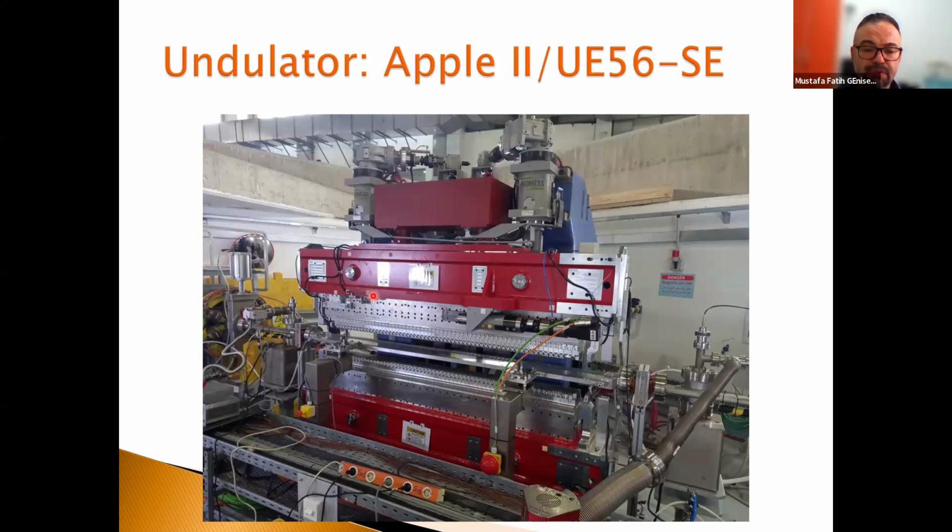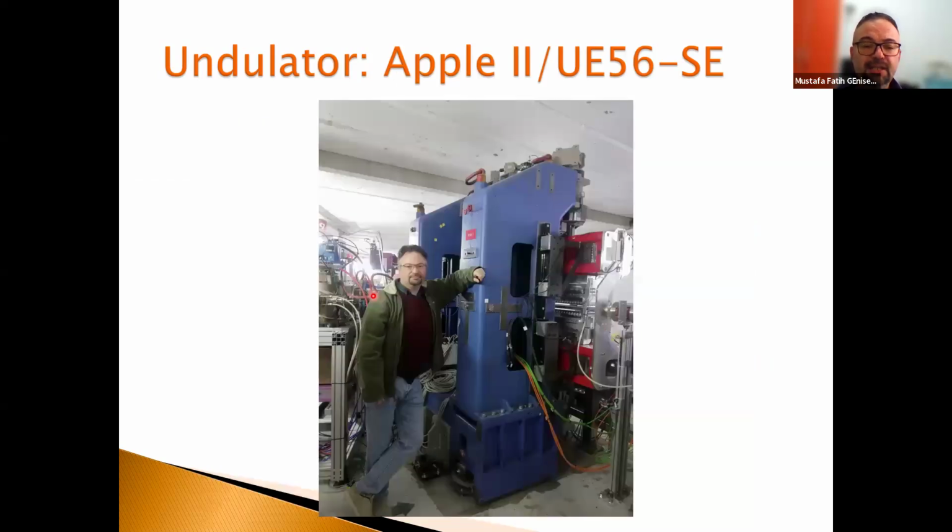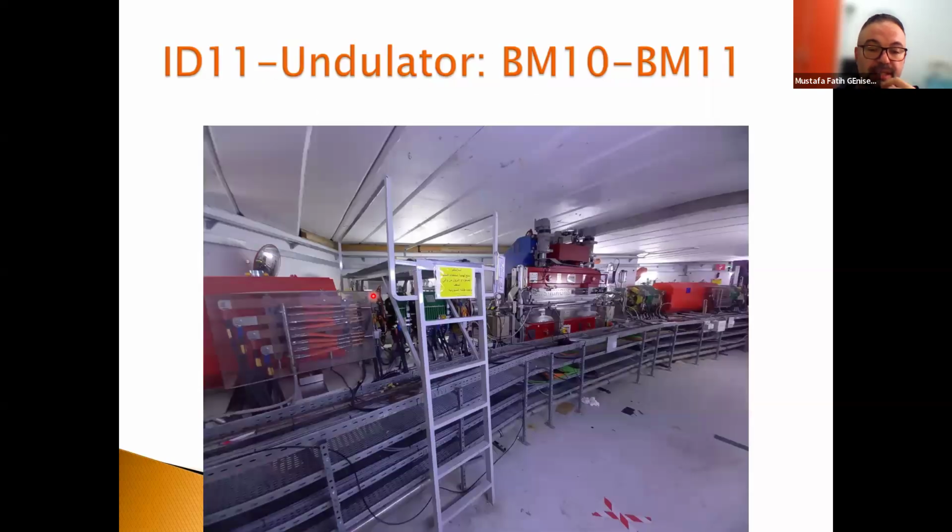You can see the picture of it here. And here, you can see me. I didn't put it just to show how handsome I am. It's just to show that it is a huge piece of equipment. It is more than 9 tons. And here you can see the picture from the side, and you can understand why we call it ID11.